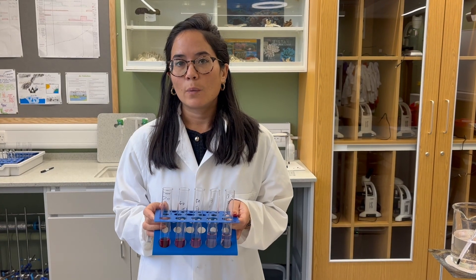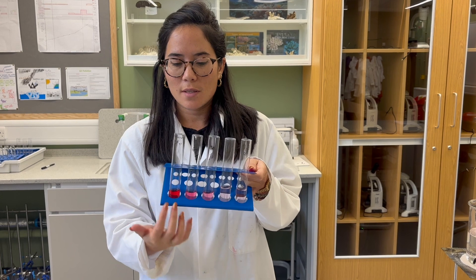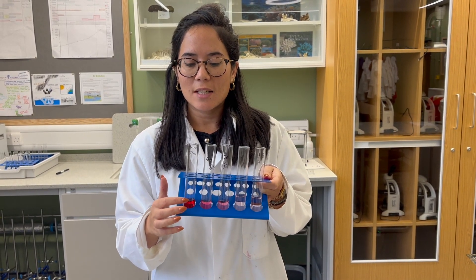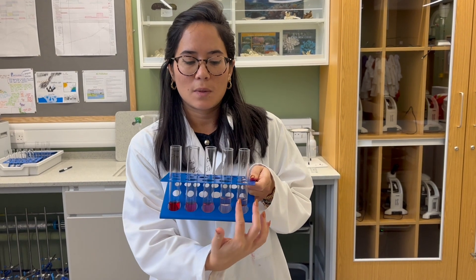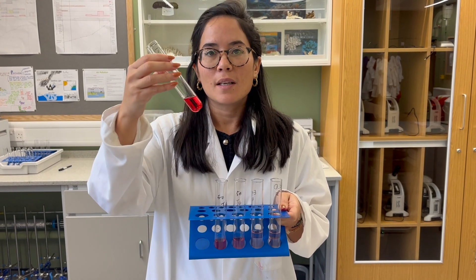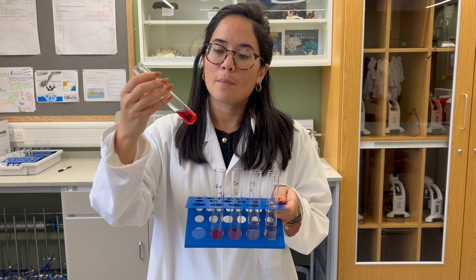After half an hour we can already see an incredible difference. This is the hottest temperature, so you can see that more stain has leached out of the beetroot compared with the lower temperature end. We're going to use the colorimeter to prove this quantitatively — but isn't that amazing? Huge membrane damage at the high temperatures.